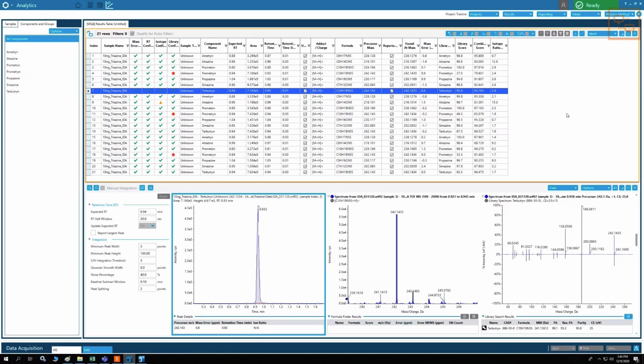A special word. We used it in a lecture. Isomers. Yes, they are isomers of each other. Exactly correct. So they are isomers of each other, and not only that, but unfortunately they have the same retention time. In this chromatography, they are not separated. So that's why I mentioned the XIC. The XIC is very deceiving because they coelute. So the chromatography is not able to separate them.